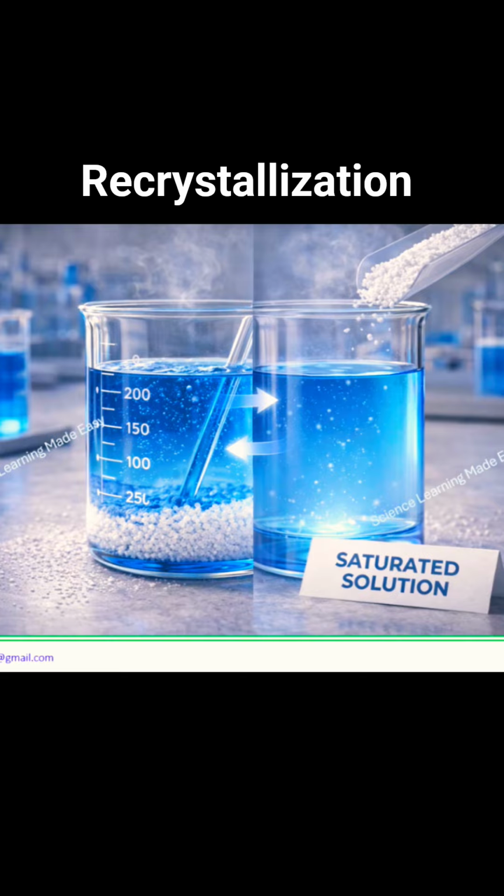By definition, it is a solution that has dissolved every possible bit of solid it can hold at a specific temperature. In other words, the solvent is completely full. Every drop of liquid is already working as hard as it can just to keep the solid in a dissolved state. If you were to add even one more grain of solid to this mixture, it wouldn't dissolve, it would simply sink to the bottom.